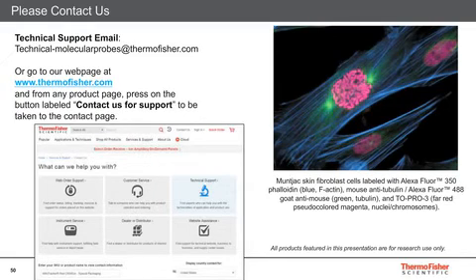Wonderful questions coming in. We have time for just one more. Our lab uses RPE for flow cytometry because it is so bright. Is it also suitable as a dye option for microscopy?